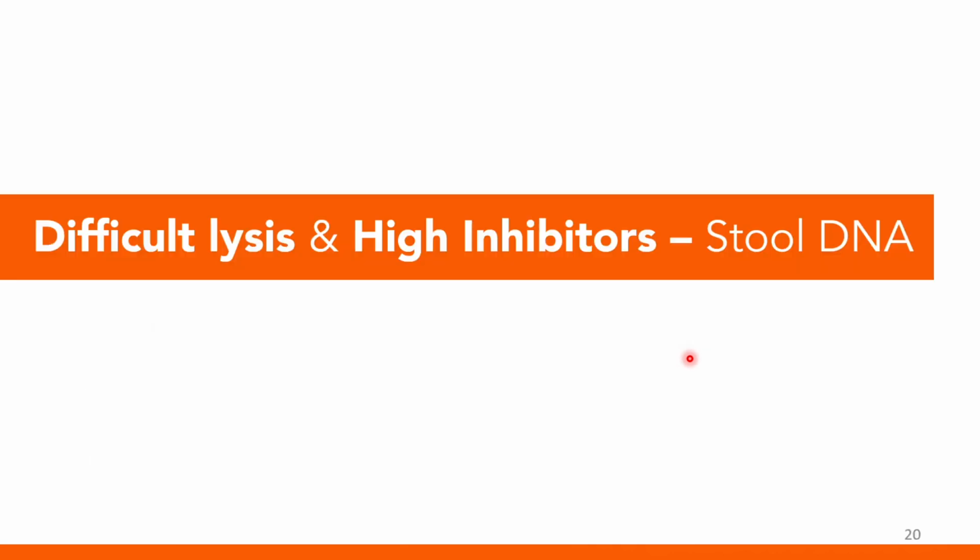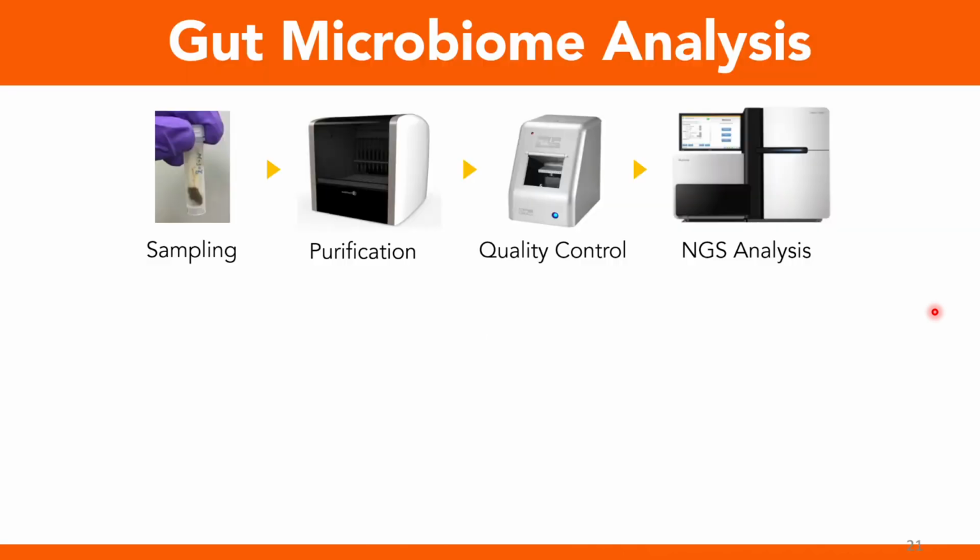Okay, so that's the second part of my presentation, and now we move to the third part about difficult lysis and high inhibitor samples, which is stool DNA. Actually, we purify stool DNA to study gut microbiome analysis.